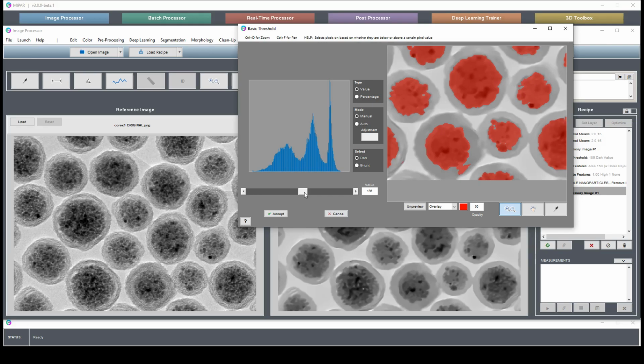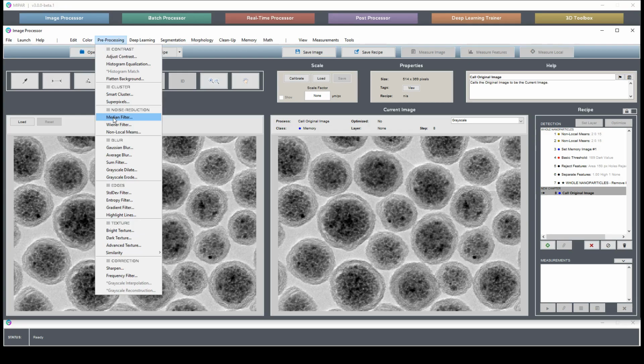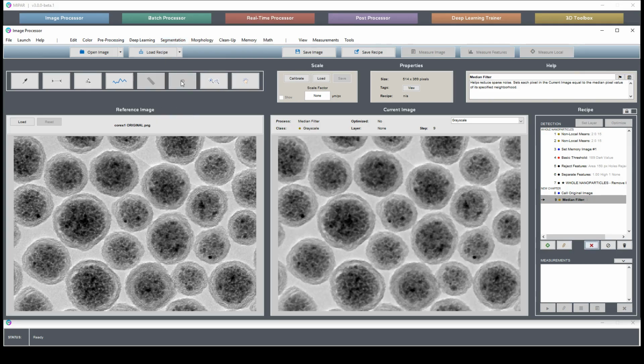So what that tells you is our pre-processing here that we did was a little bit too strong. Okay, if we had some of the variation still in here, that variation might have cut this part away, and we wouldn't have such an all or nothing switch here. That would give us a little bit more wiggle room in the values to produce a nice segmentation. So rather than starting with this really strongly preprocessed image, to find the cores, we'll do a little bit less. So say we have our median filter with a window size of 3, which will help out some, but we'll need to do some post-processing of the segmentation to make up for the fact that we haven't been as heavy-handed in our pre-processing.